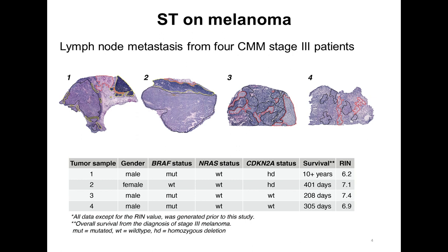And now I will show the results for melanoma. We did a pilot study to assess whether spatial transcriptomics would be useful to study heterogeneity in stage 3 melanoma.